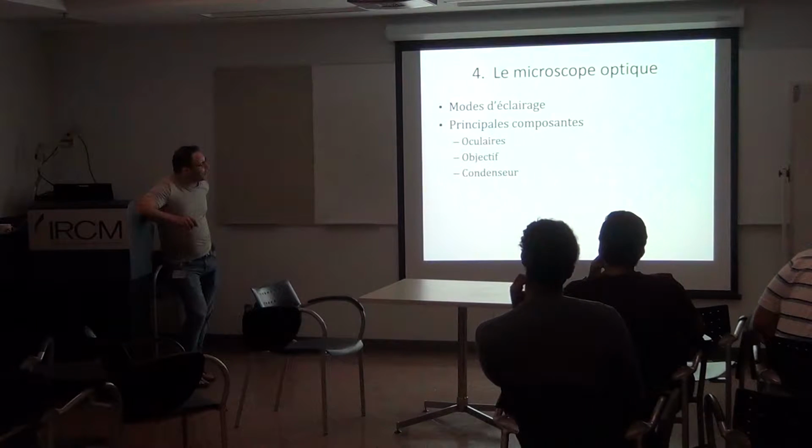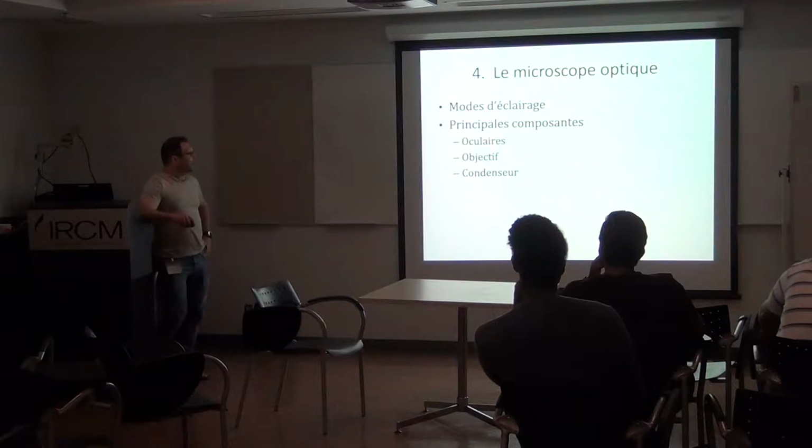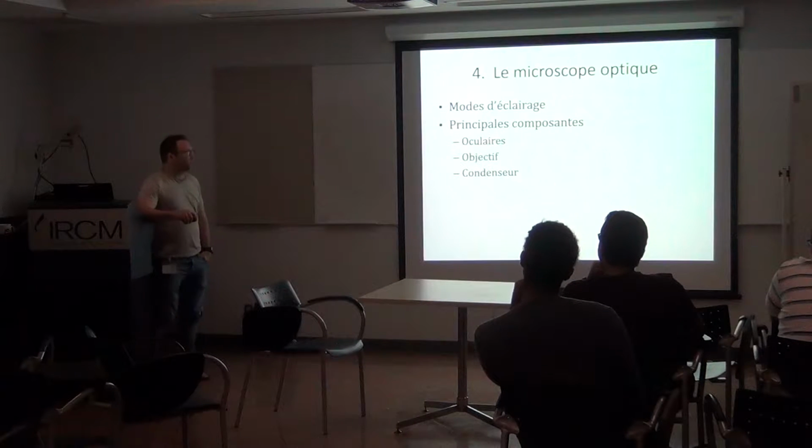We are now talking really about an optical microscope, and the most important parts of a microscope are, well, nowadays it's not really more important, but it is still, I think, really nice to have the ocular, so the place where you put your eye, which is nowadays sometimes a computer screen, instead of having those things where you look.